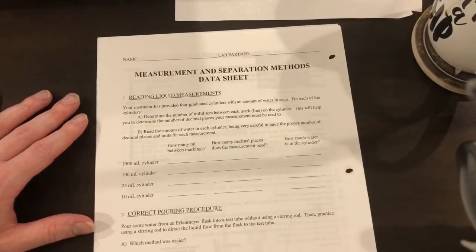On to correct pouring procedure. You'll need an Erlenmeyer flask, a test tube, a stirring rod, and some tap water. As you go through this portion, answer these questions: Which method was easier? What advantages does the stirring rod method provide? And if you were pouring concentrated acid instead of water, which method would be safer?